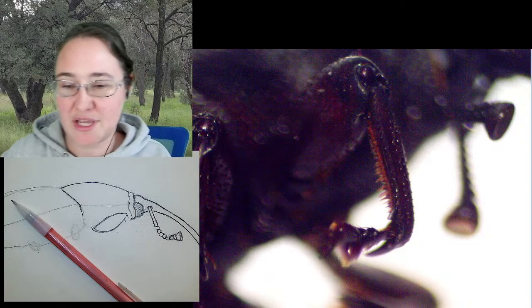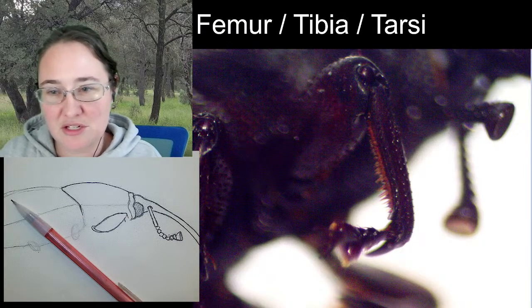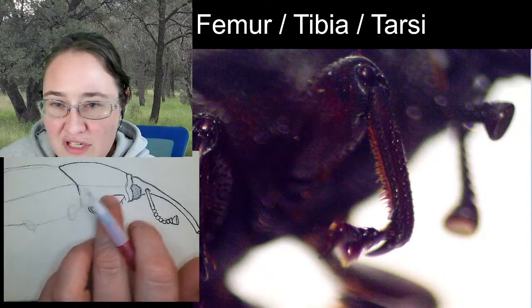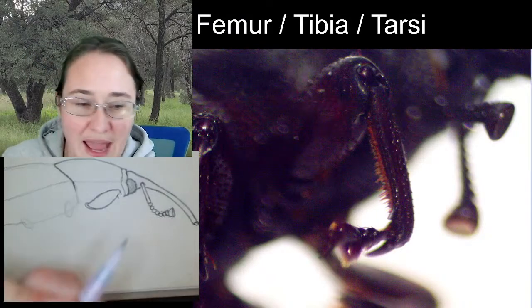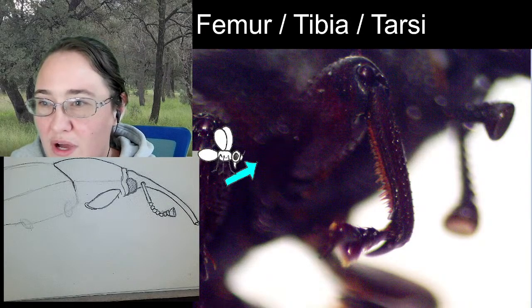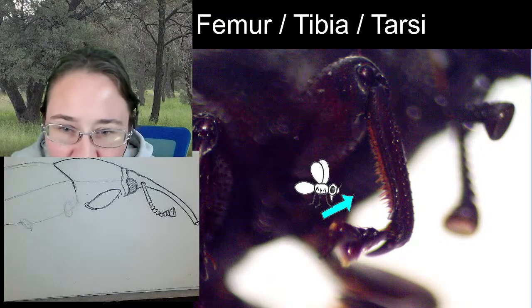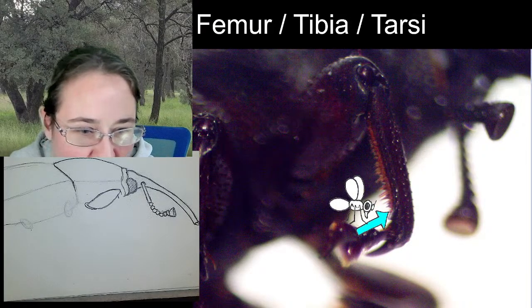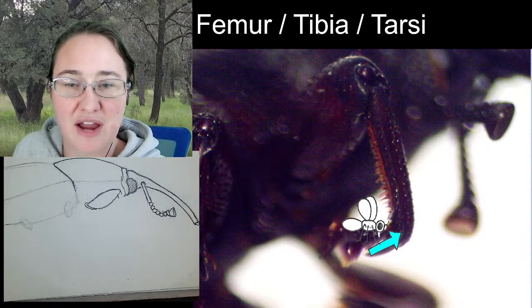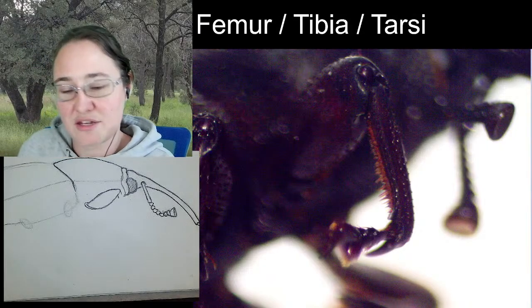So we already did trochanter, but then the rest of them are femur, then tibia, then tarsi. So those are the segments on an insect's leg. The femur is this first one here. The tibia is this one. And what's nifty is it has a series of spines. It's not just that one spine on the bottom, but there is also one up here that's going backwards, and there is a third smaller one that you can't see too well that comes out right around here, and it's going towards us, which is why it's a little bit trickier to see on the microscope camera.